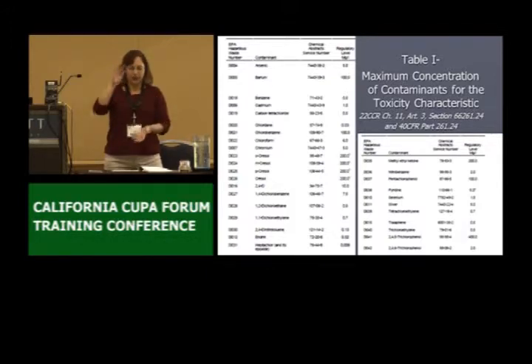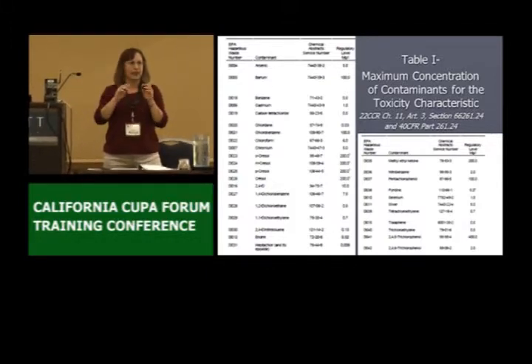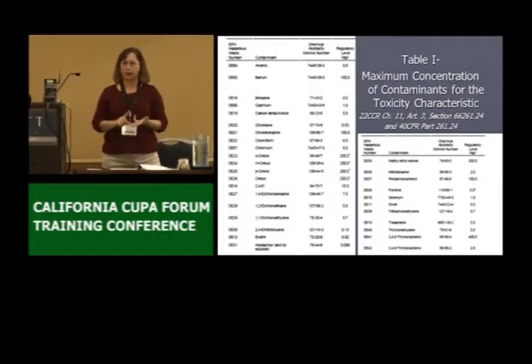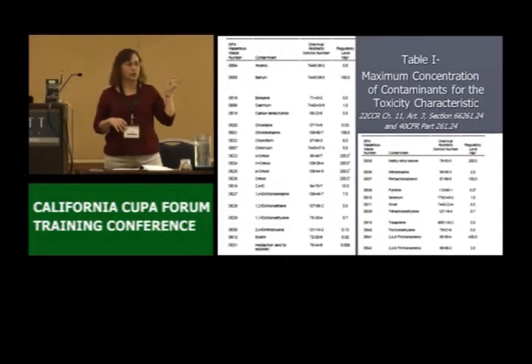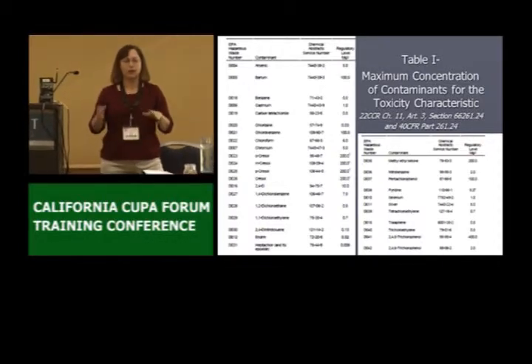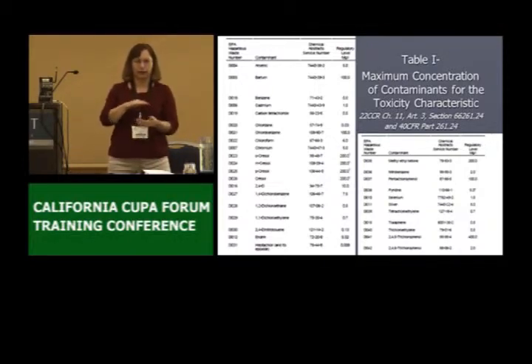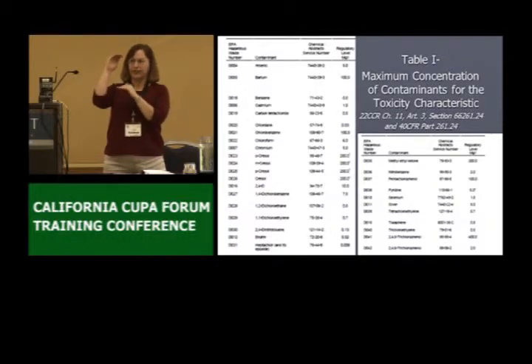After that 18 hours, everything settles, it's filtered and analyzed for, usually, metals, but you can also do volatiles, semi-volatiles, and tons of different tests. There are different TCLP regulations that she was just showing you on the slide. What we're actually analyzing is that water, the solution. We're not back calculating it to the solid. The new sample is just that TCLP extract.